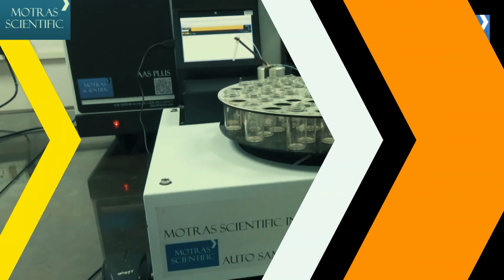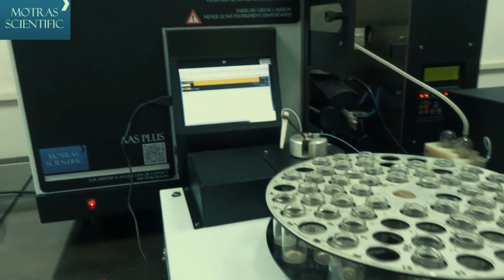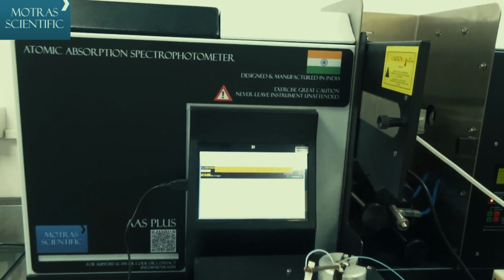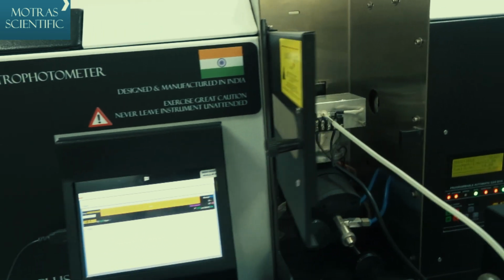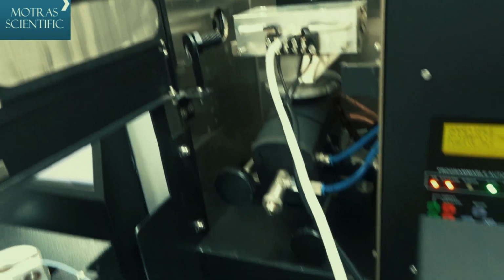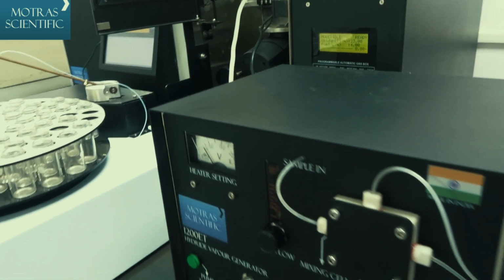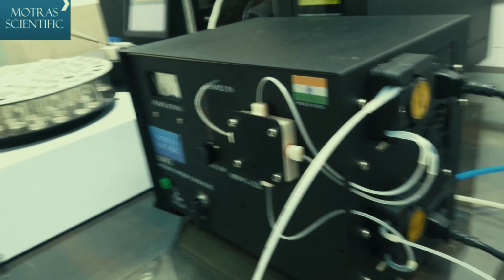As you can see, the Atomic Absorption Spectrophotometer is set up with autosampler and has an integrated touchscreen which runs a Microsoft Windows 10 based application. This is the hydride cell which is heated electrothermally. Here you can see the hydride generator with independent peristaltic pumps.